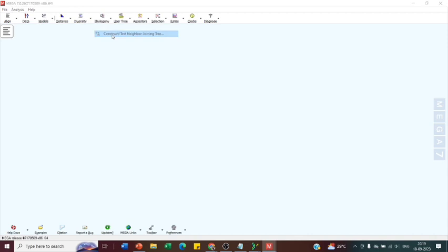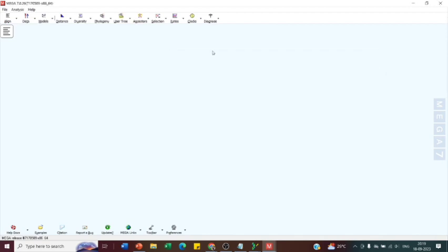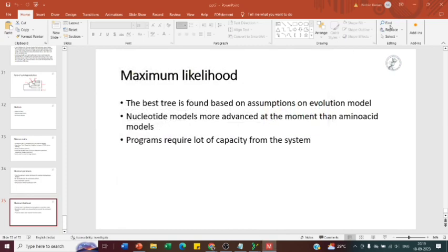They are asking for something. I think we need to have a BioEdit file. I think we were somewhere wrong. I think we have a hexokinase file there. I will just pull that.